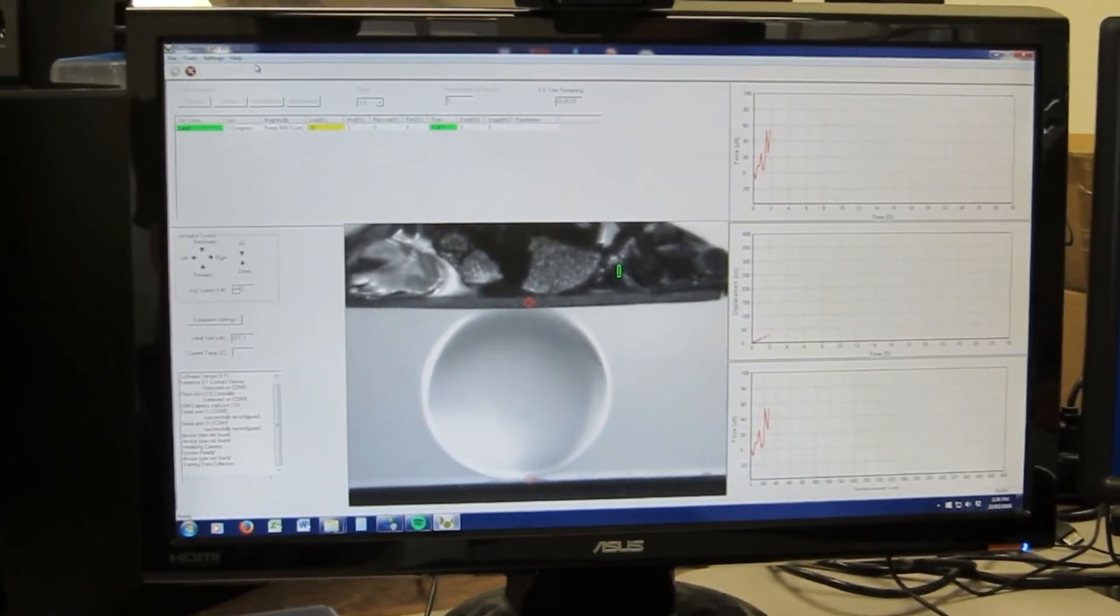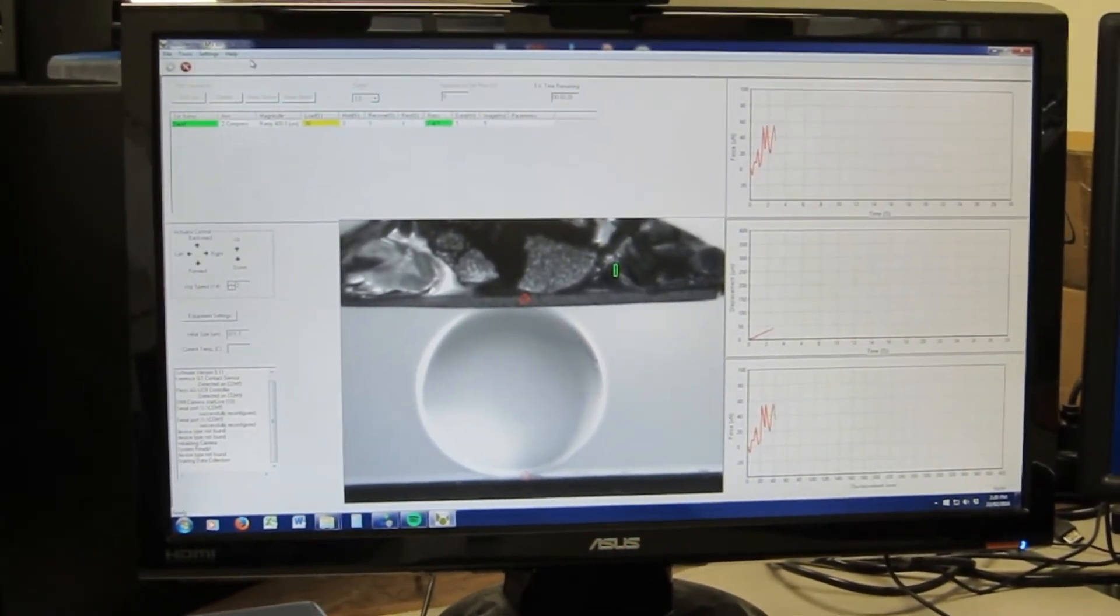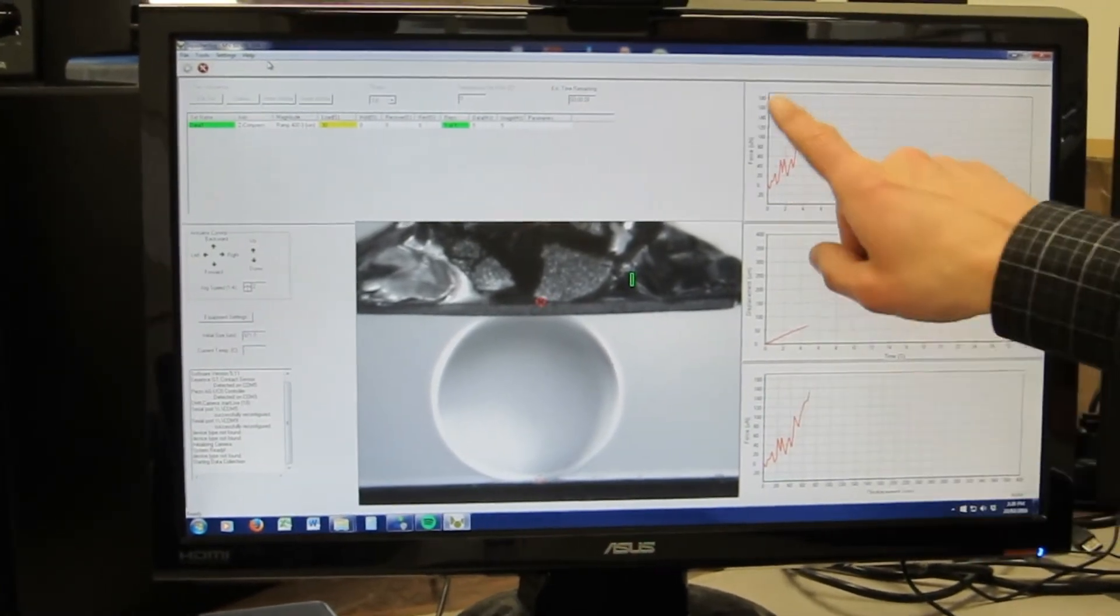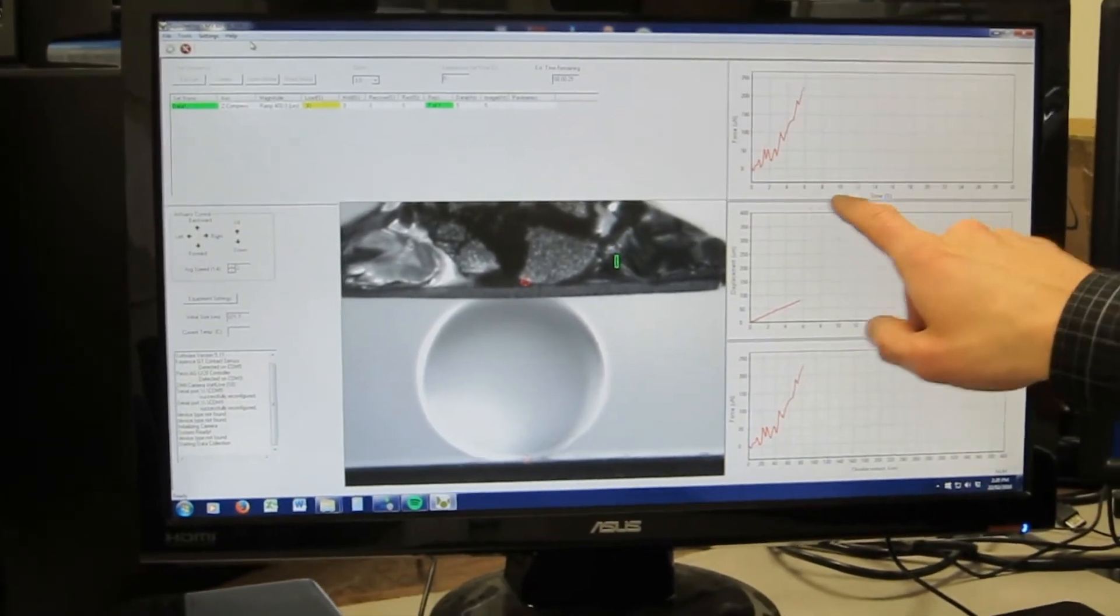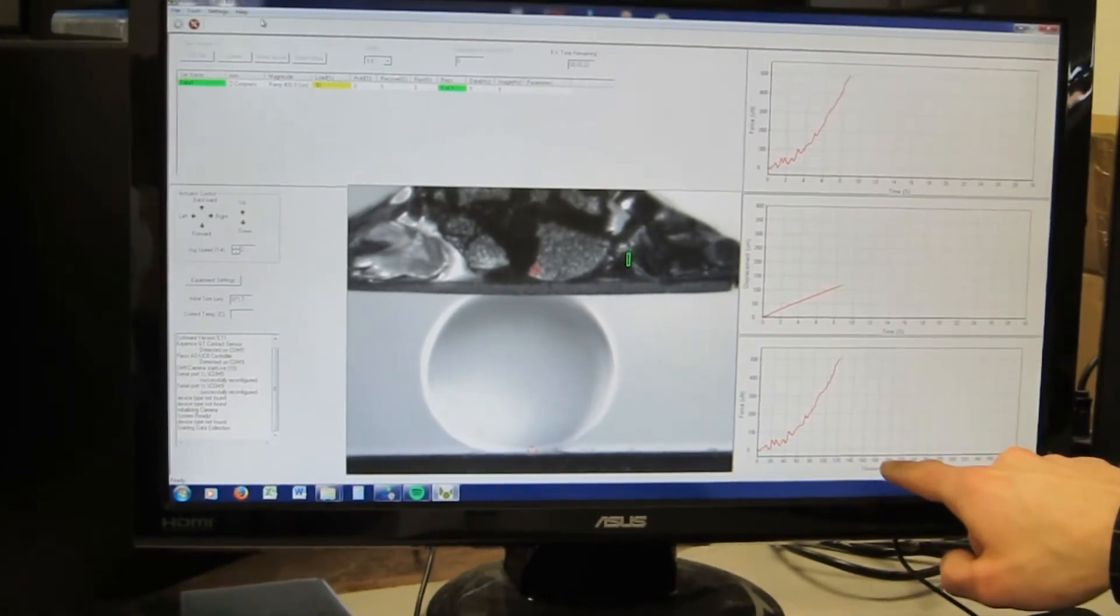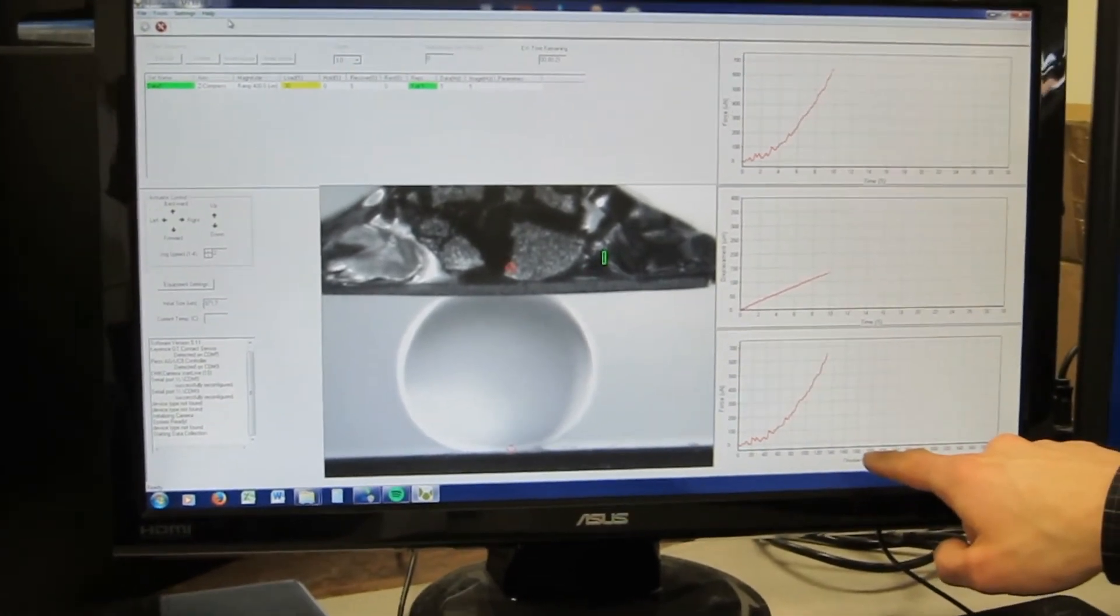And you'll see we're coming in here to do a compression. Force versus time, displacement versus time, and force versus displacement.